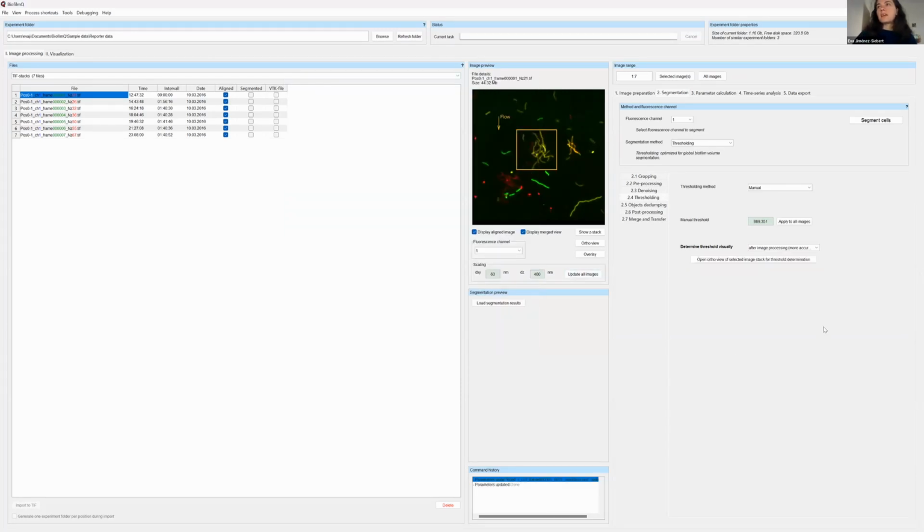And as I said, this one was after applying the image processing, but you can also choose to not apply it. And probably you can also not see this one now, right? No? Good. No, we don't see any.